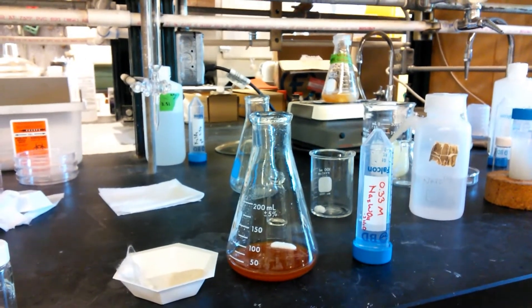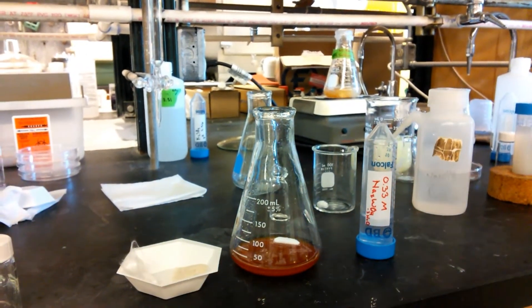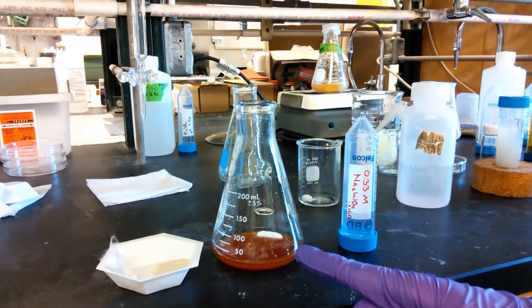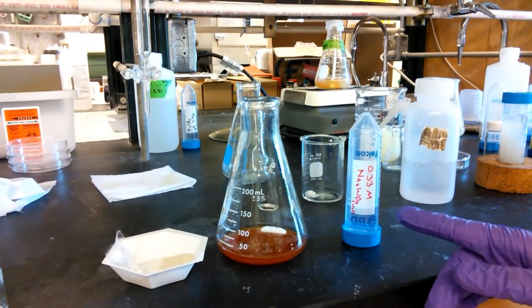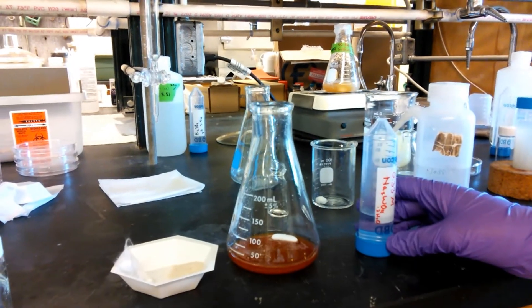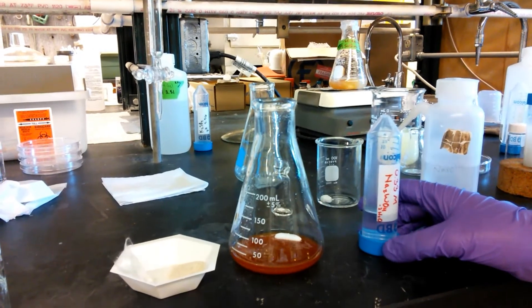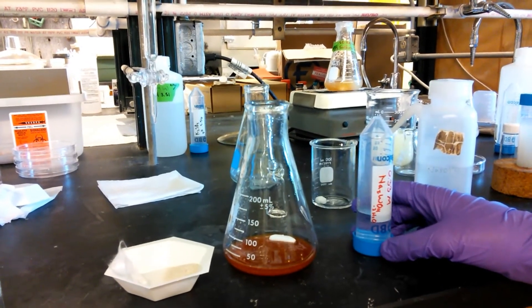Here are the major components of the cation exchange column we'll be using. This is glass wool, this is sand, this is a proton exchange resin, and this is my sodium tungstate which I will be using to convert into tungsten oxide in this approximately 0.33 molar solution.